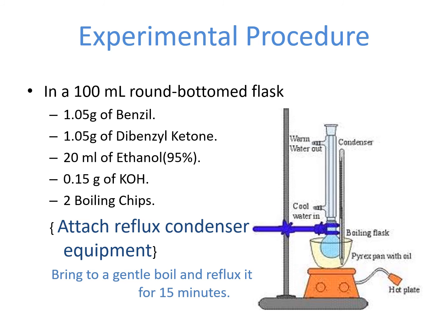The reflux experiment will run for 15 minutes, and after that we will expect a deep purple color solution.